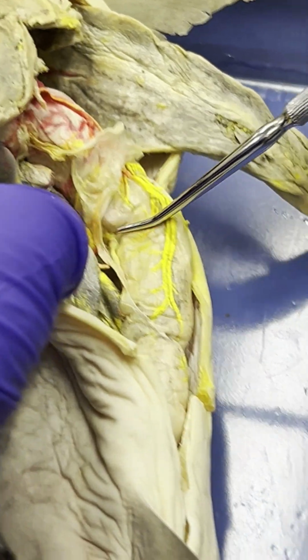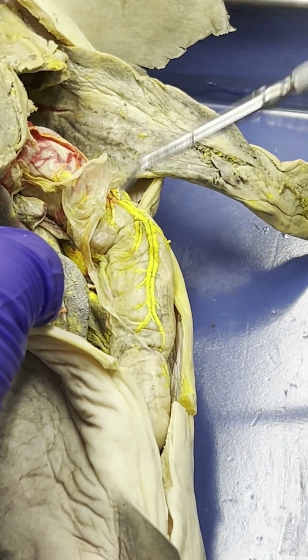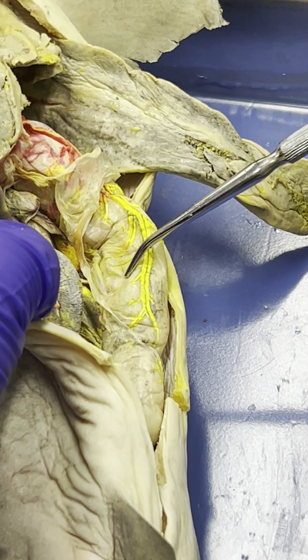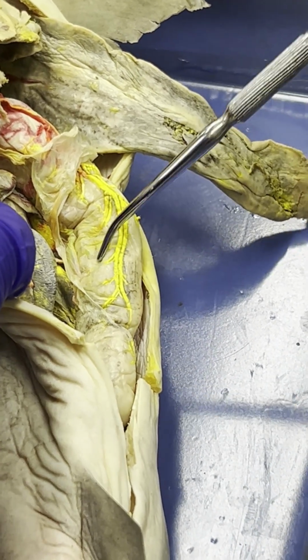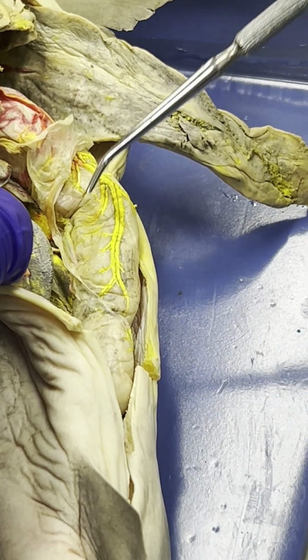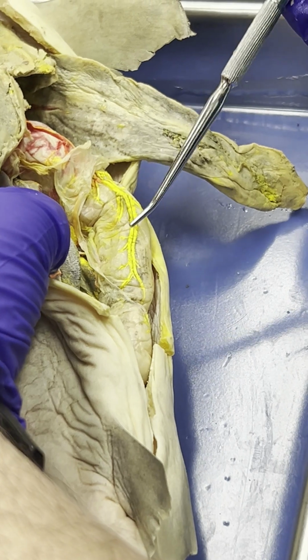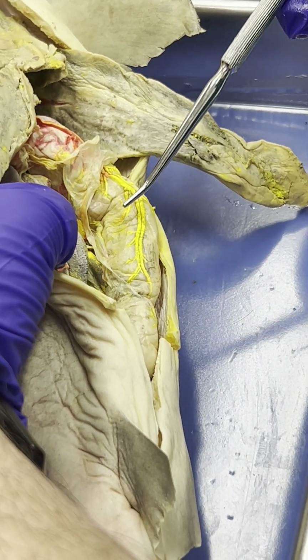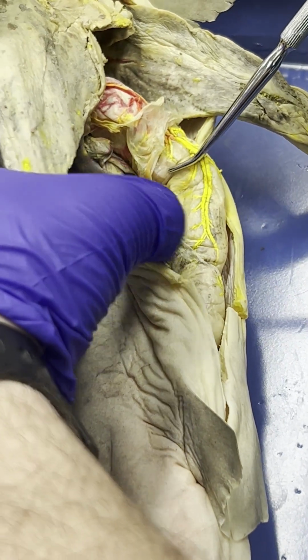And what we're going to have you guys do as well, I'm not doing it in this video, but in lab, I want you guys to slit open these valvular intestines so then you could see the spiral valves that are also in the valvular intestines. So the spiral valves, they serve the same function as the rugae in the stomach. It's basically increasing surface area to help digest and break down the bolus.